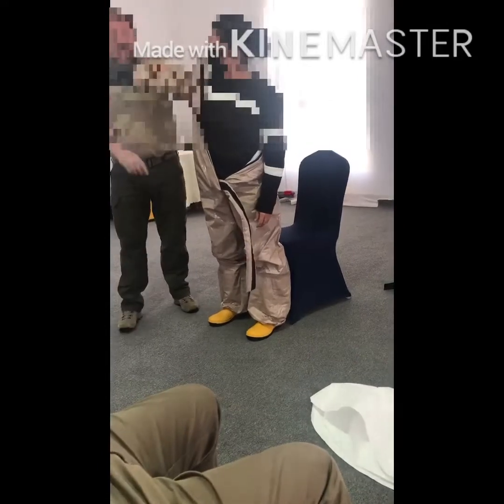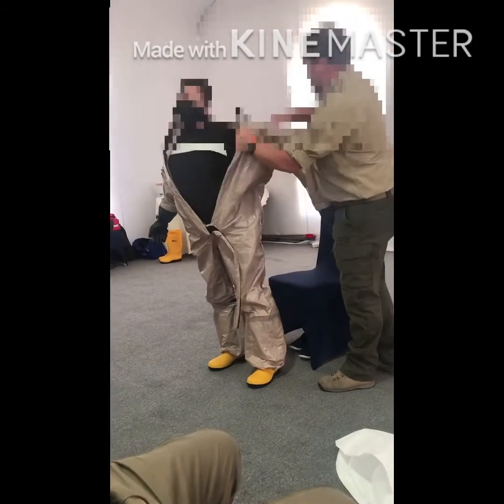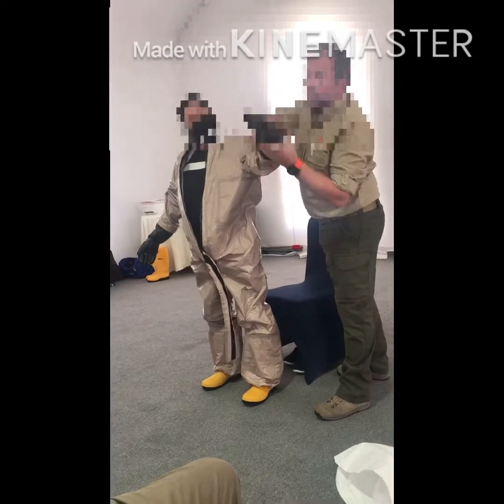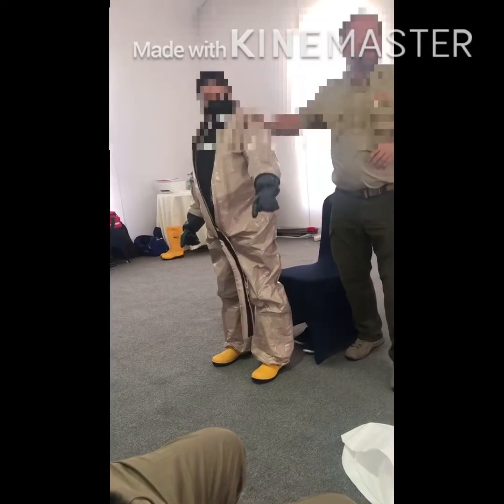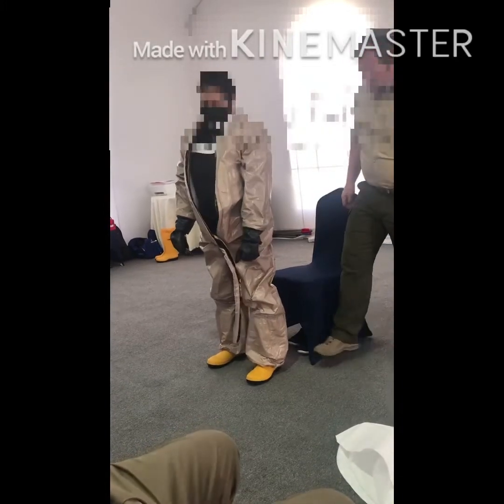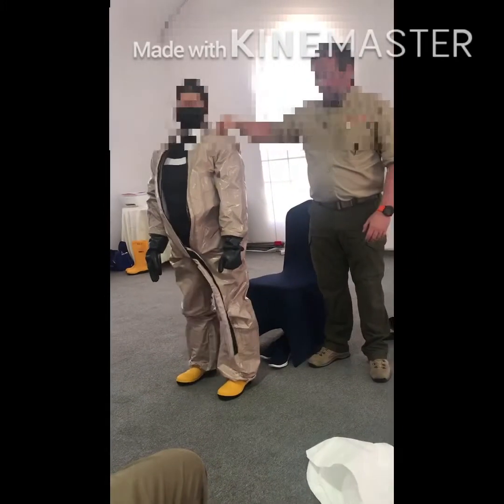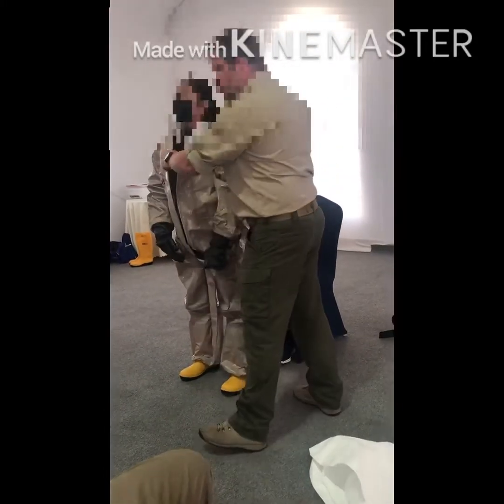On these suits, you'll notice the gloves are built in. This glove is built in, it won't come off. This suit is a little bit too big for her. This is which level? This is your proper level C suit. So this is what you will receive from Mr. Hassan if you go to a real incident. This is an actual level C suit.